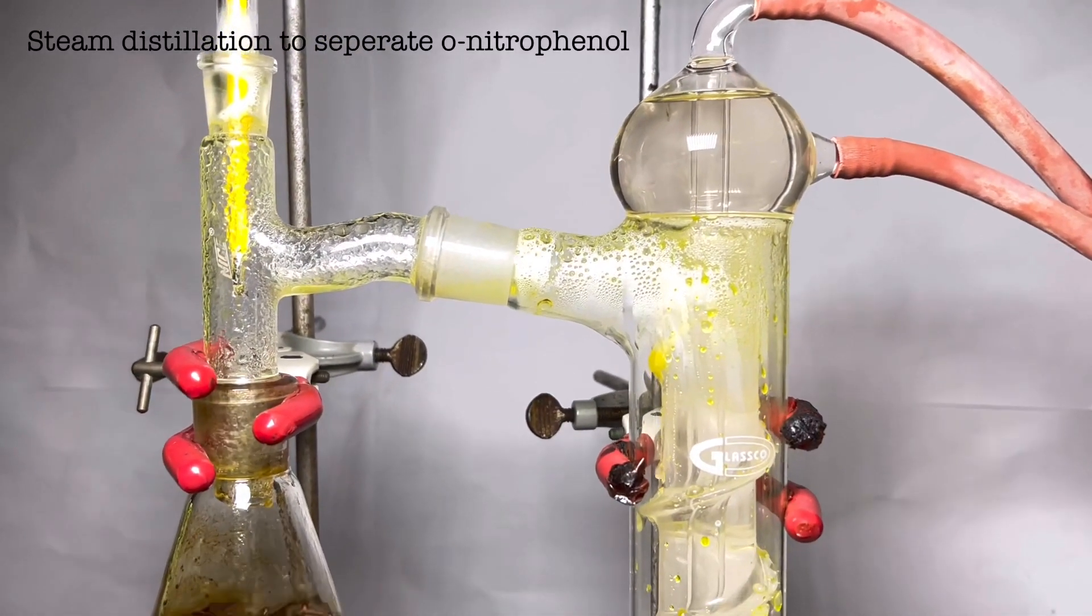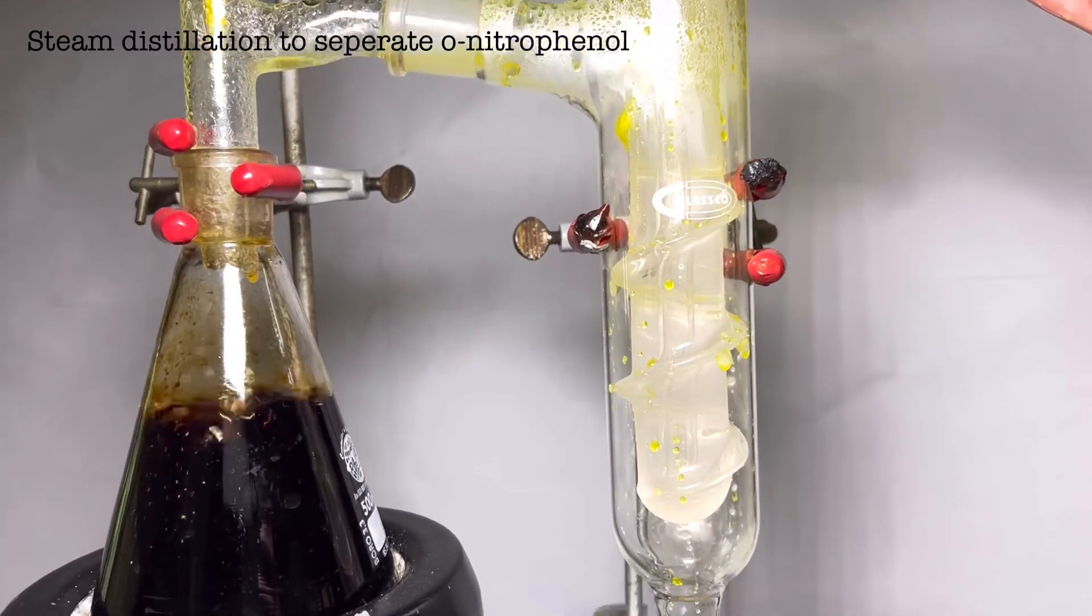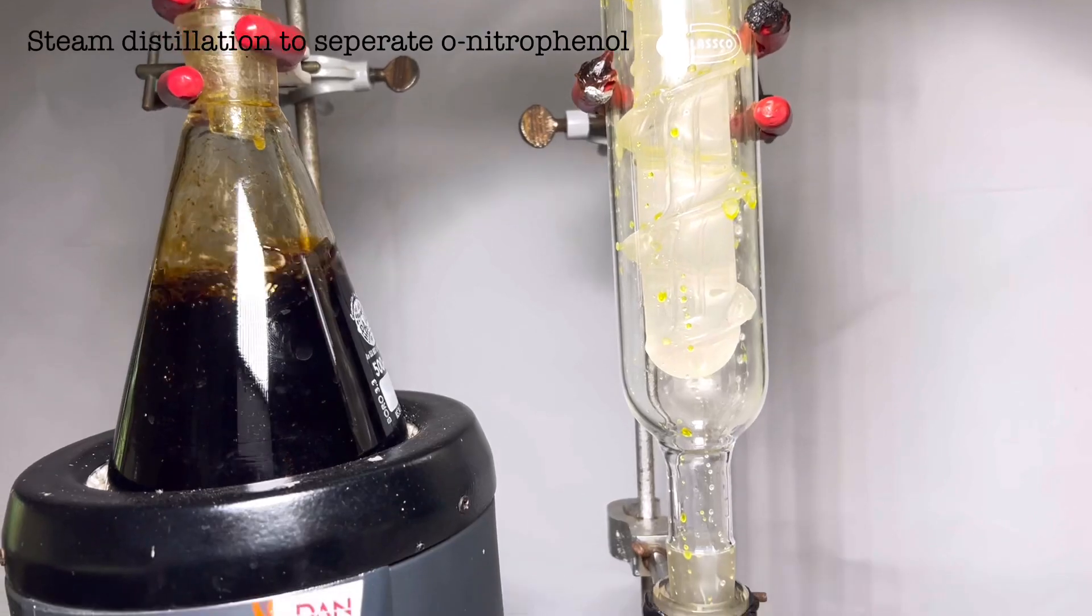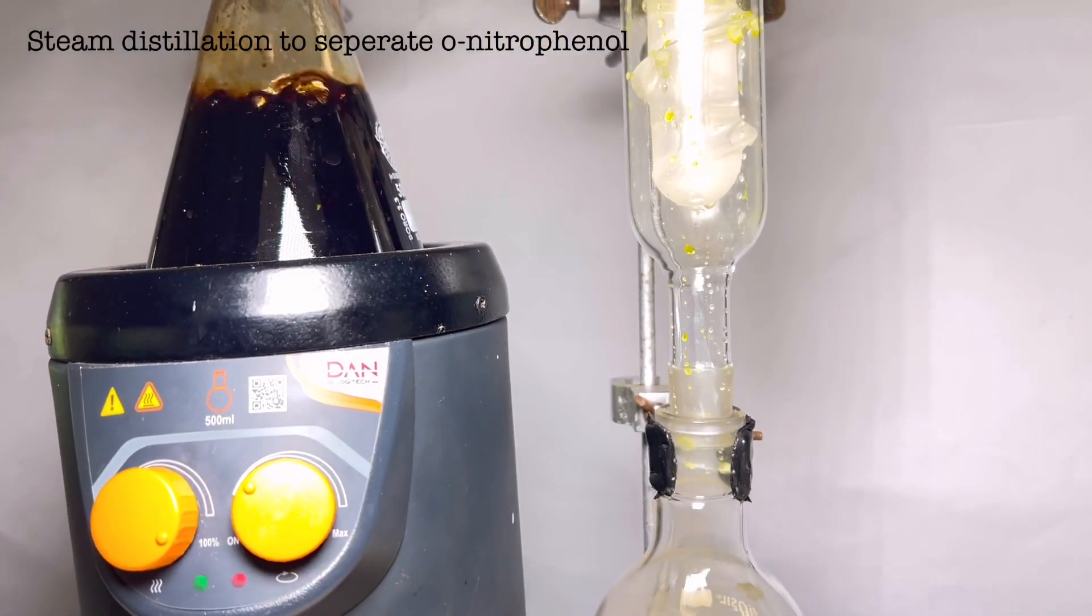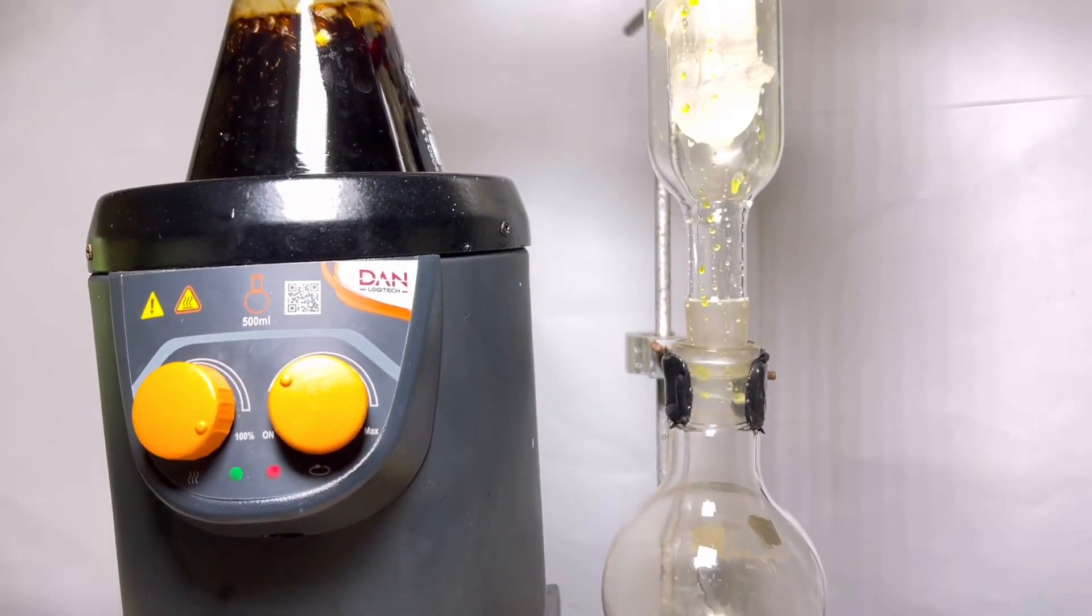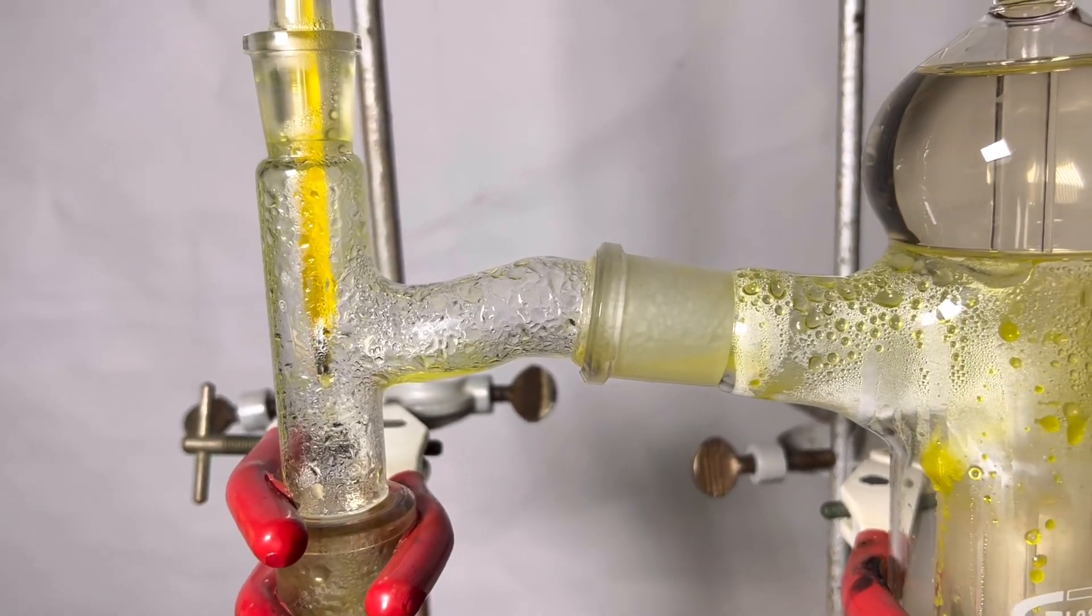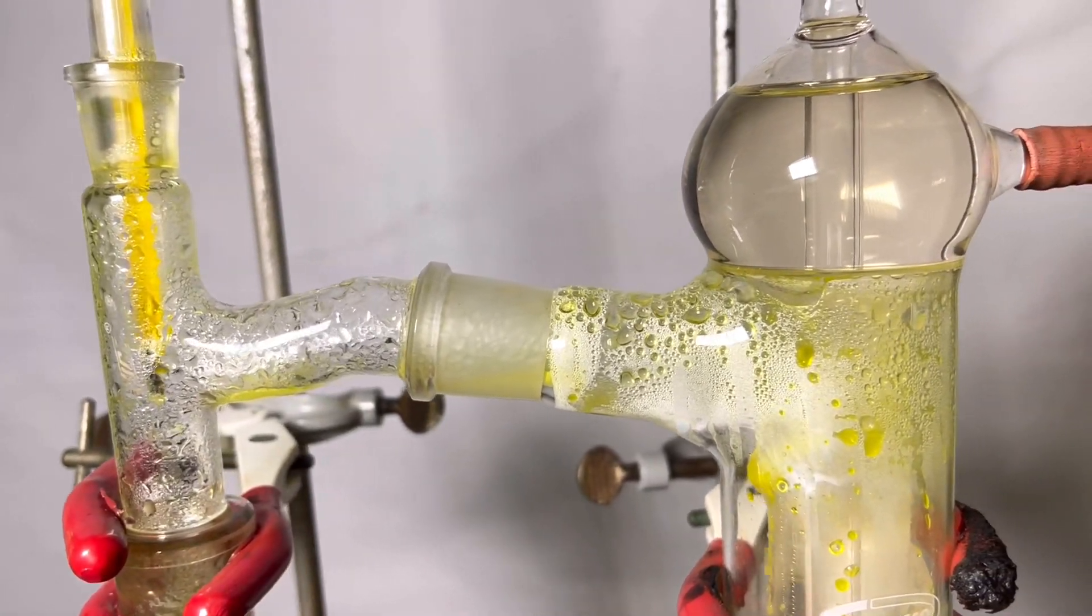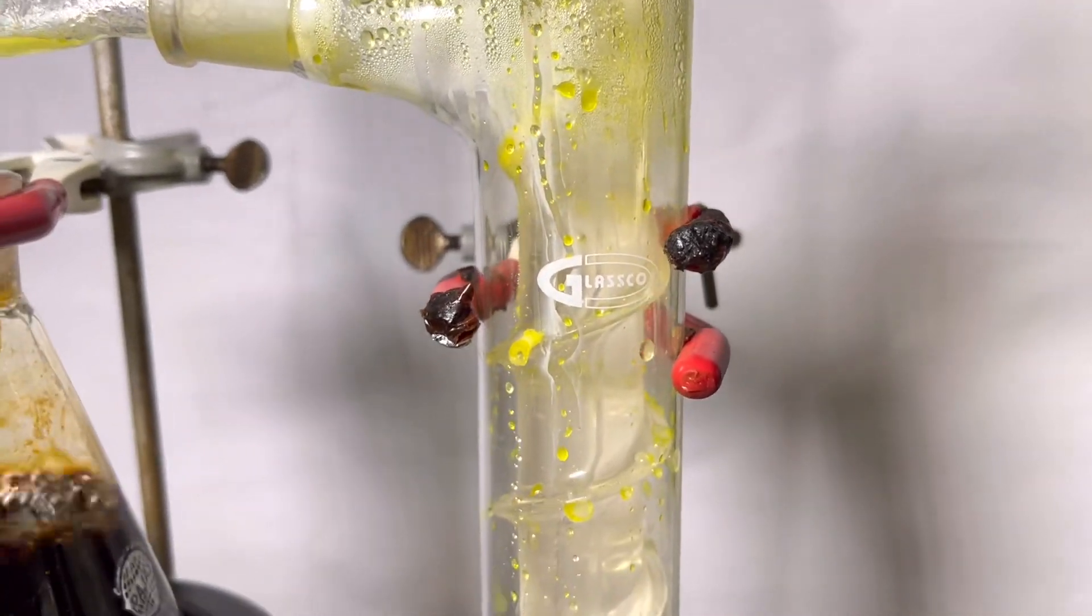Ortho-nitrophenol has a bright yellow color so it is very easily understandable here. We keep the distillation continuing until all the yellow color disappears from the condenser. Sometimes solid ortho-nitrophenol gets crystallized on the walls of the condenser and even in the distilling head. To make that go into the receiving flask, just stop the water circulation in the condenser. This will warm up the condenser column, liquefying the crystals.